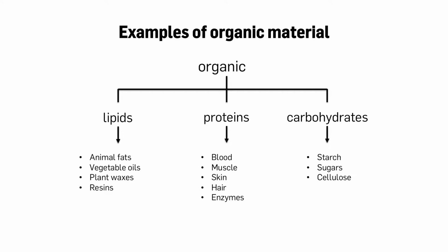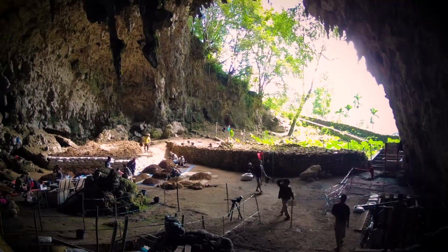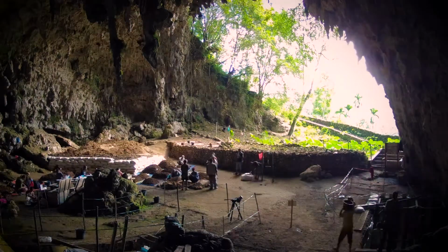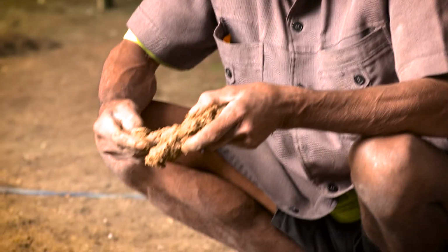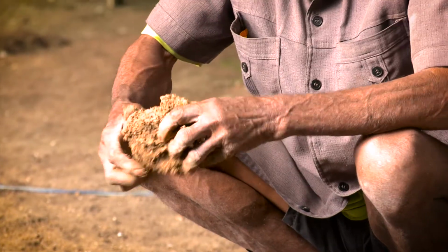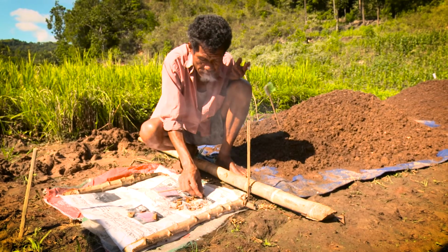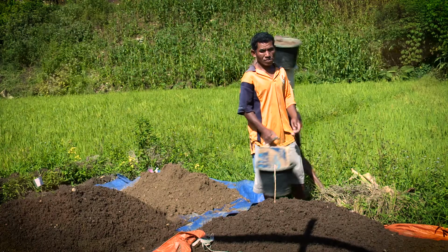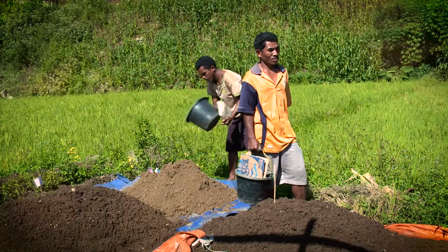It is quite difficult because the samples are very old and some of the material has become degraded. Obviously, an archaeological site is not a sterile site, and our technique requires quite sterile conditions. And so we have issues like contamination, people not wearing gloves, but that's expected at an archaeological site. So we just work within the confines of that environment. And also degradation. At Liangbua, it's quite hot, it's quite humid, and these conditions aren't very good for preservation of residues.